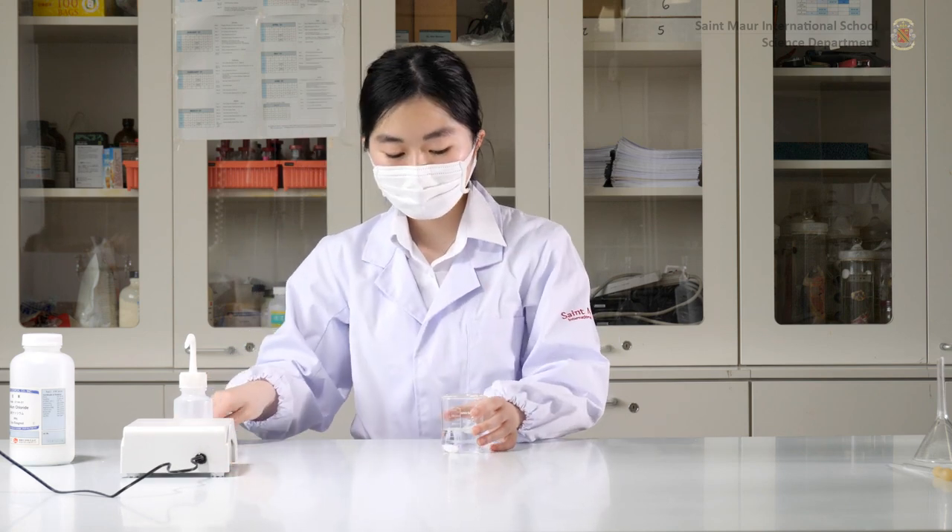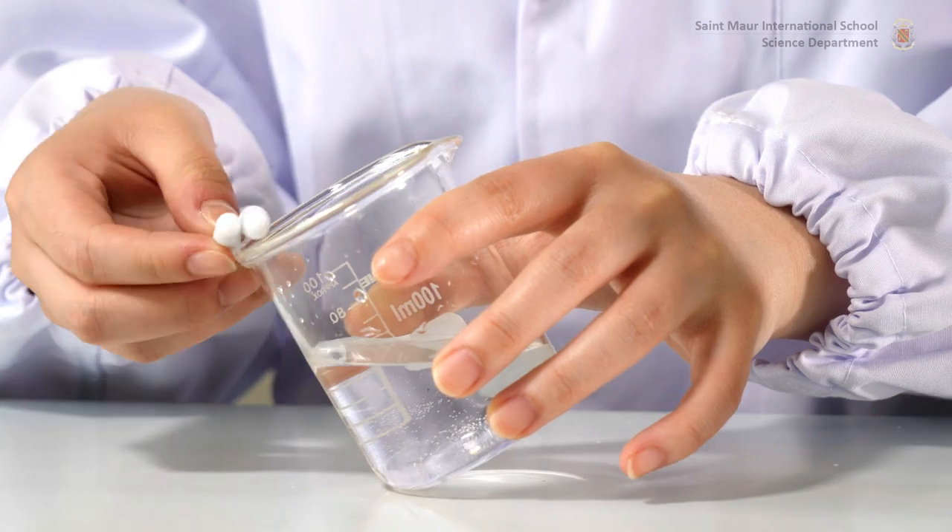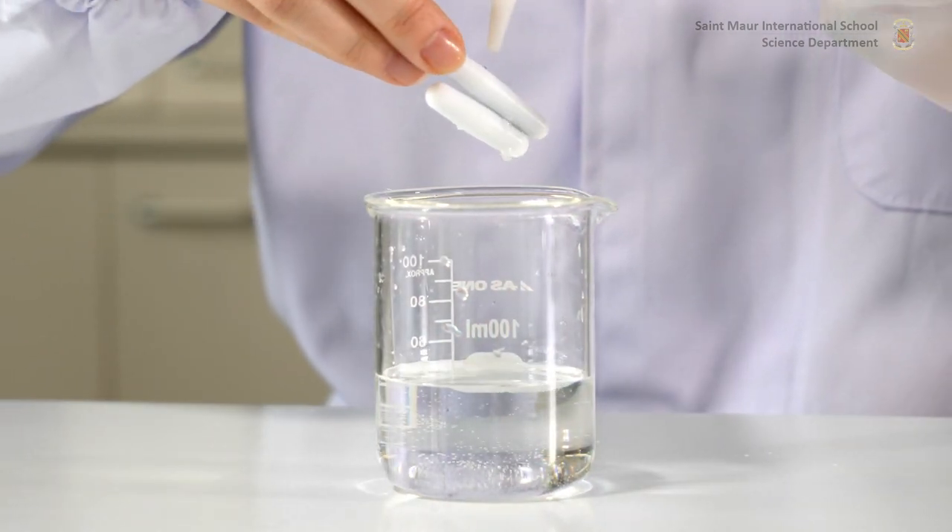Remove the magnetic stirrer using another stirrer in order to avoid introducing unnecessary objects into the solution. Rinse the stirrer with distilled water over the beaker to prevent losses.